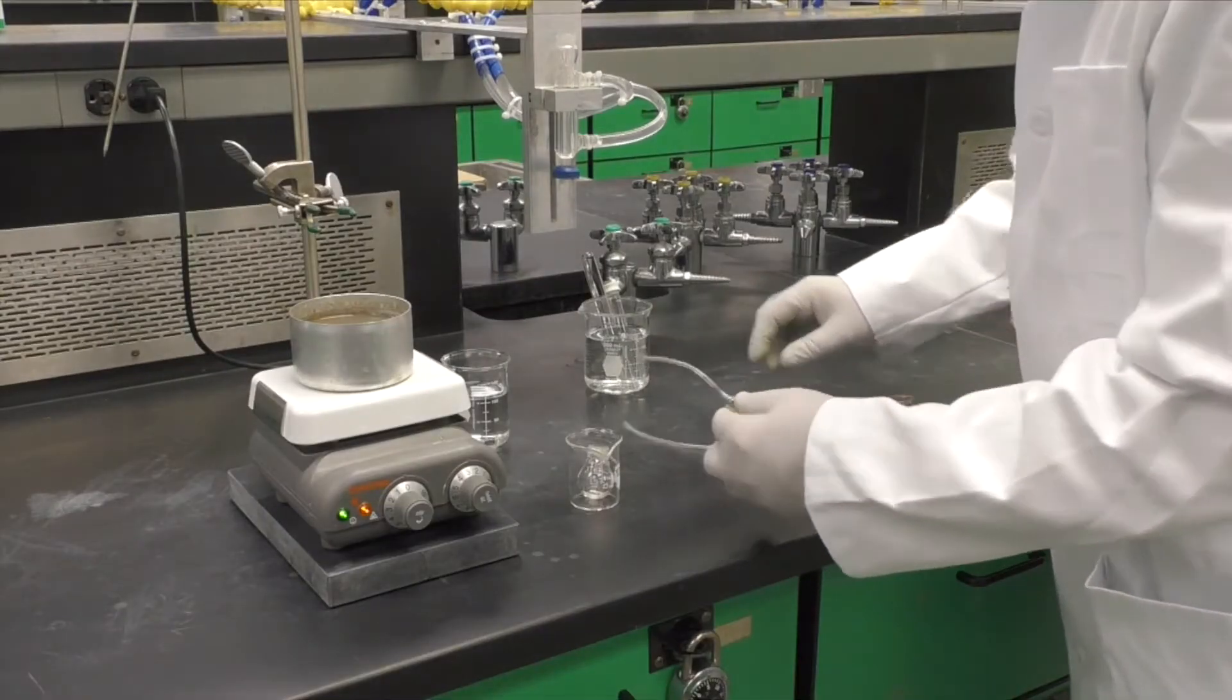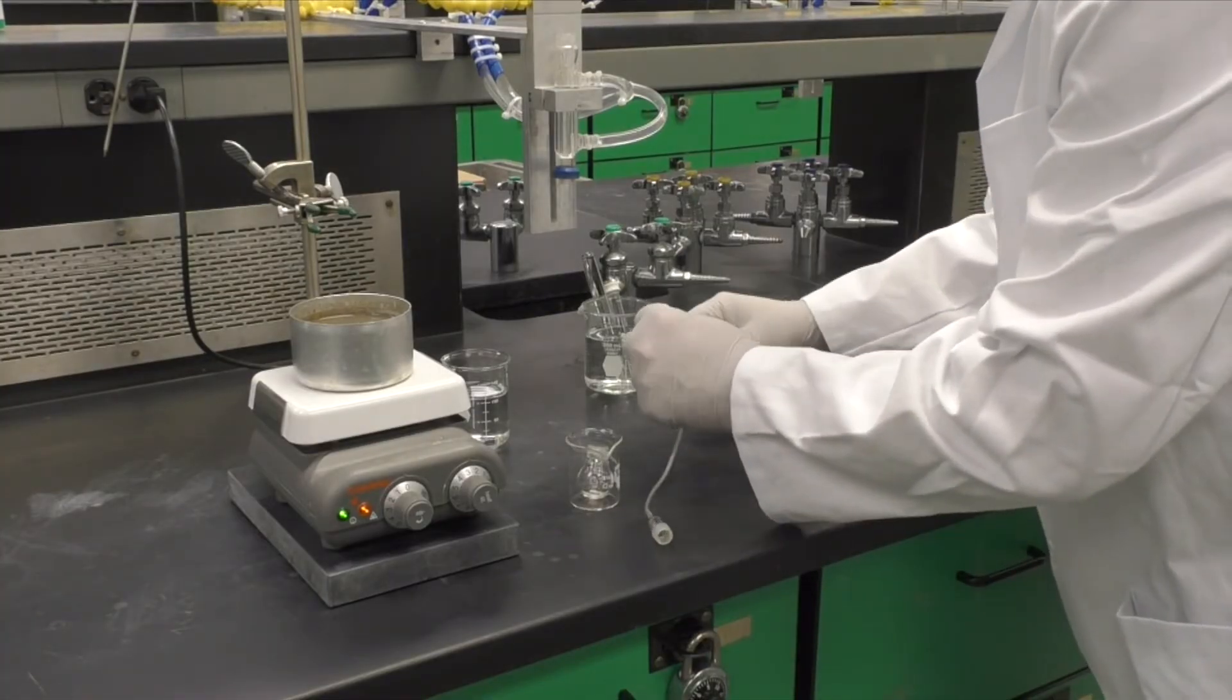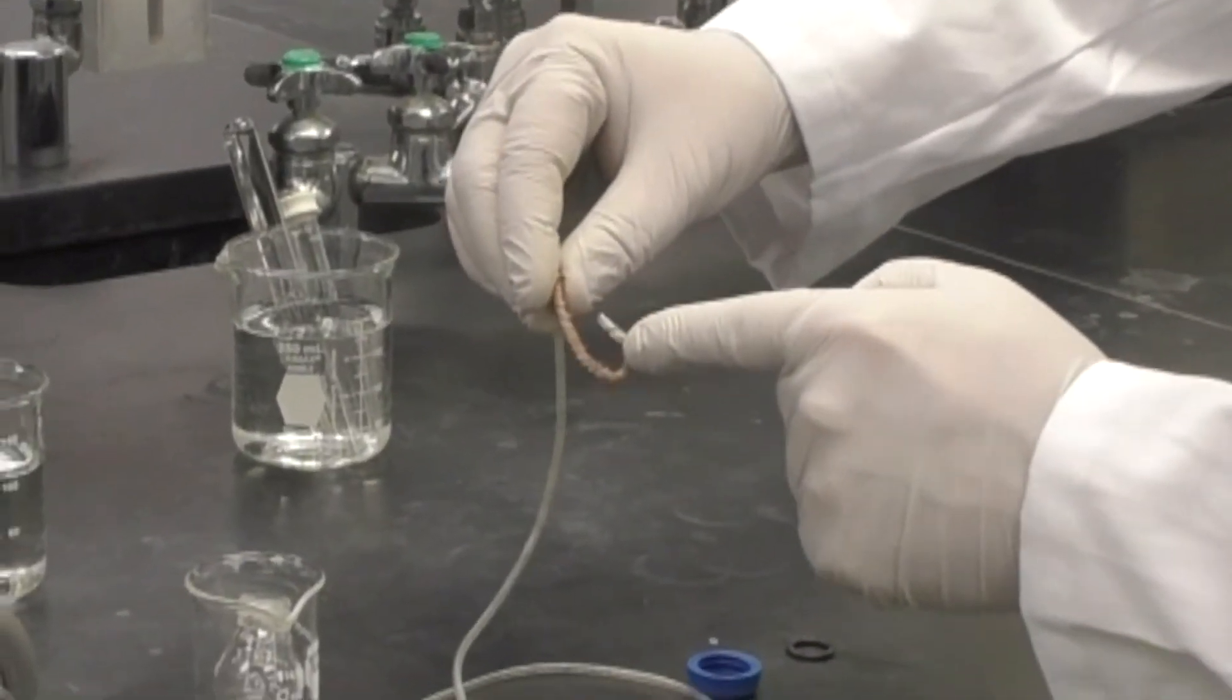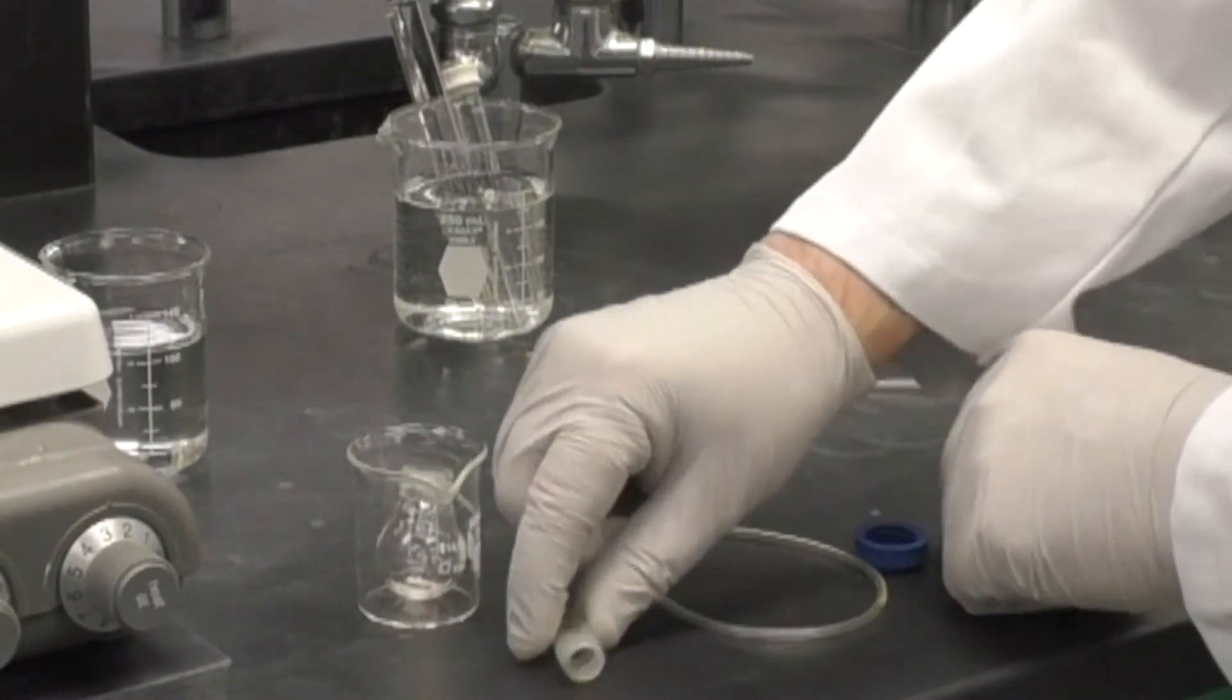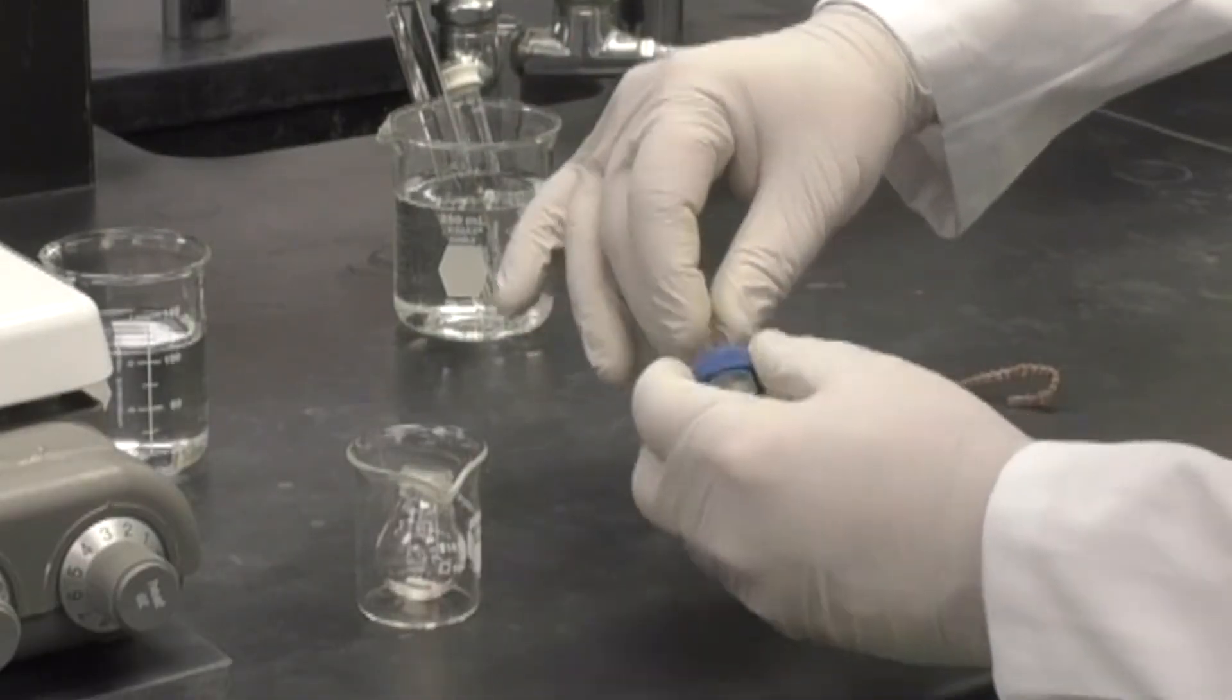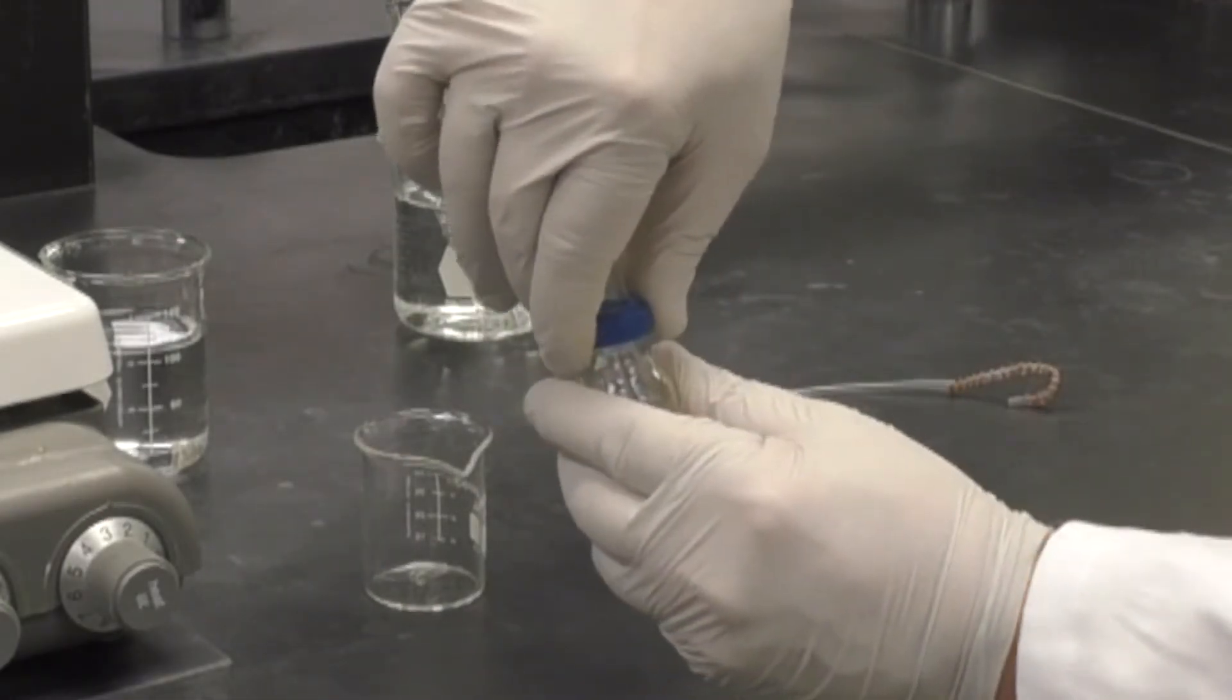To complete the setup, first check the Tygon tubing attached to the collection apparatus for any melted spots, holes, or any other type of damage. Make sure the copper-wrapped end forms a nice J shape. Then slide a blue ring over the glass end, followed by an O-ring, then slide the round bottom flask on and screw the blue ring tightly onto your flask.